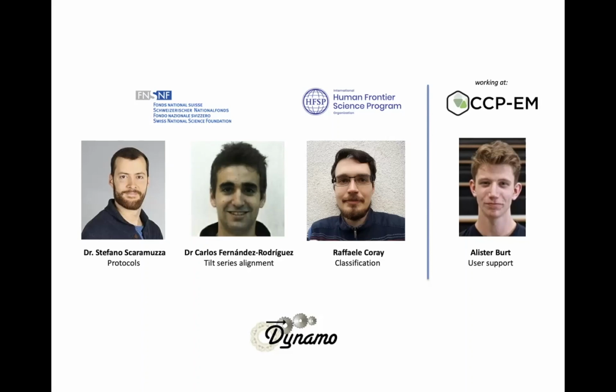Yeah, it looks like Pete Meyer has a question as well, so if he wants to unmute. Yep. Hi. Thank you for the great talk. I have a naive question about the tomography algorithms you mentioned as far as the feeding back. It seems like there are philosophical similarities to the expectation maximization family of algorithms. Is that something that's illusionary, or is that actually related? In the sense that you're using parameters from one layer and cycling it through another layer and just stacking multiple and cycling.